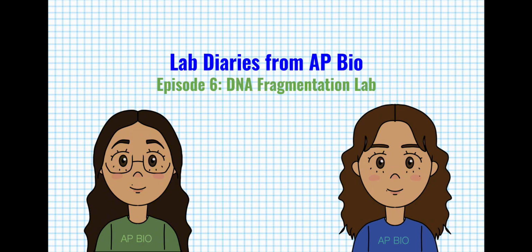In this series, we will cover different lab expectations and review key labs. This is our final episode, episode 6, DNA Fragmentation Lab.